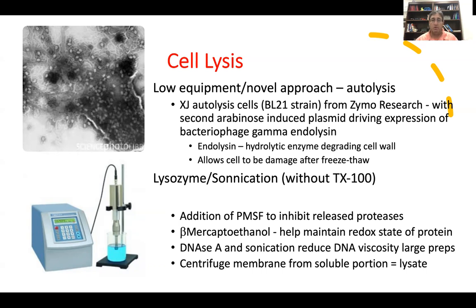Otherwise, what a lot of folks will use is a combination of an enzyme called lysozyme that degrades the cell wall, and then they still sonicate, and they often don't use detergent. Some folks will use Triton X-100. We try to stay away from that because we get good cell lysis or breakage without the addition of that detergent. When you do this, you want to make sure you're adding PMSF.